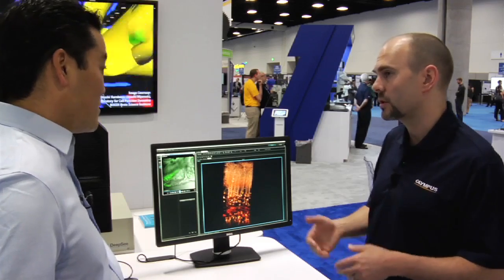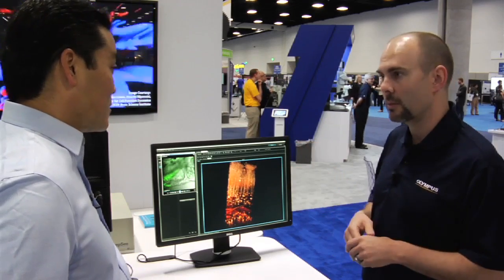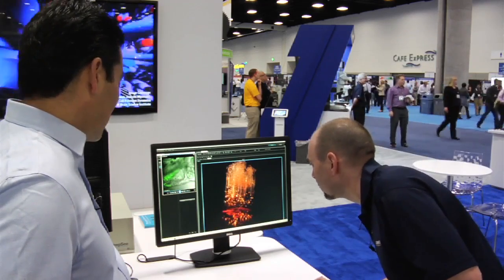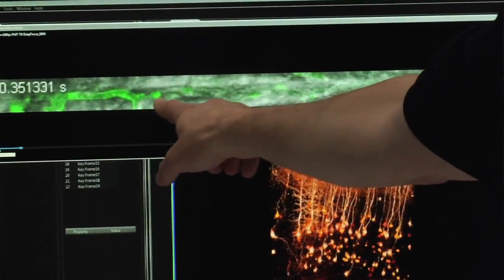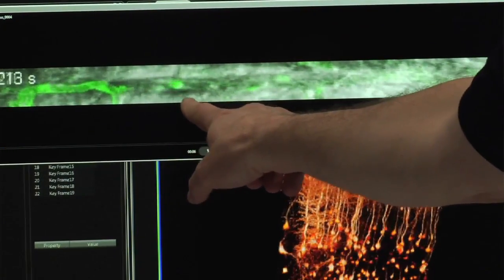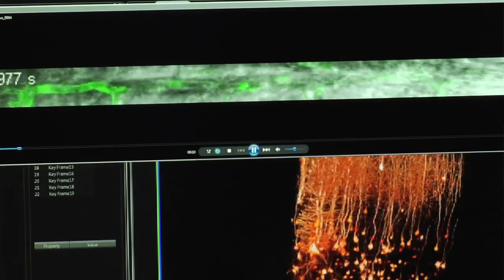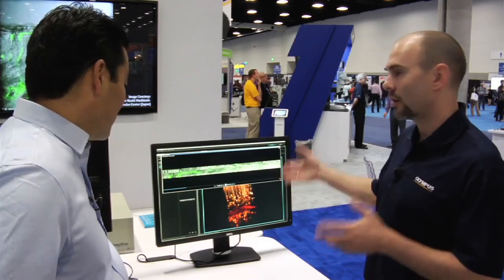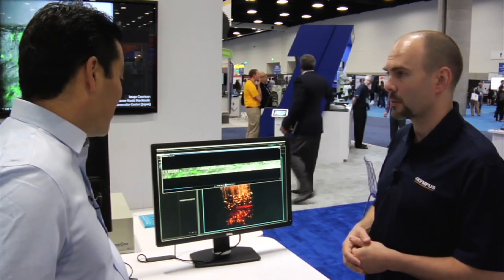This is an industry-leading specification. We can do that at 512 by 32 and we don't have to zoom in to achieve that. At 438 frames per second — we've had to slow this down tremendously — but you can see the time stamp here and you can see an individual blood cell moving through. Capturing blood flow, either for stroke models or any other high-speed physiology, would be a really appropriate application for this instrument.